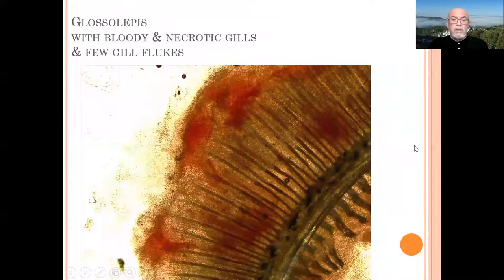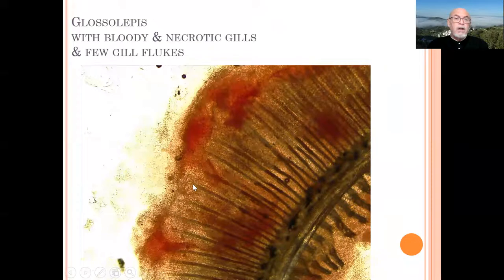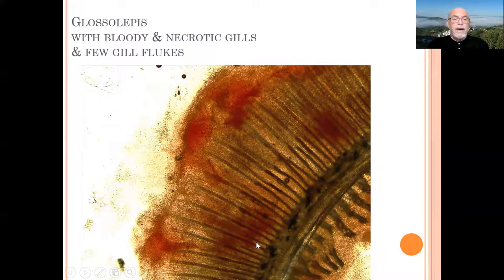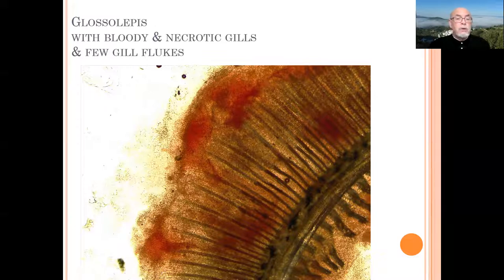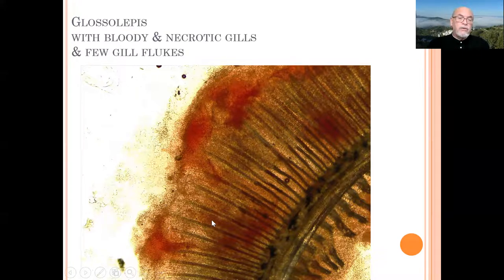If we look under the microscope, we see bloody patches on the gills and necrotic parts in the gills. So this gill is in a very bad condition and not capable of doing any good respiratory activities. The bleeding is abnormal and the necrotic patches are abnormal.